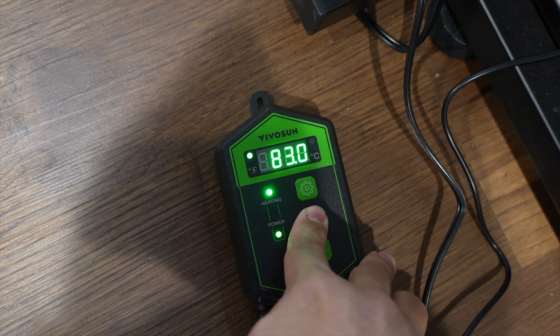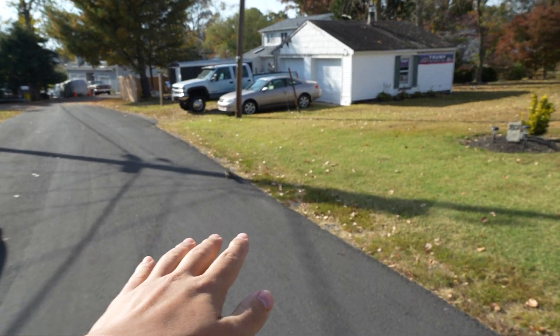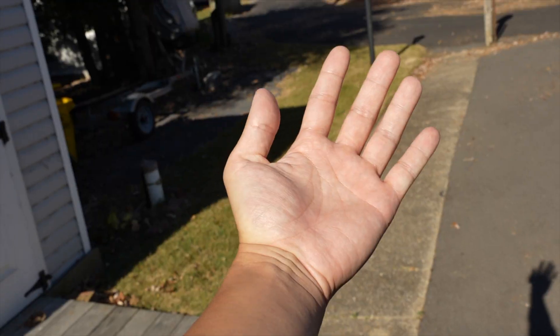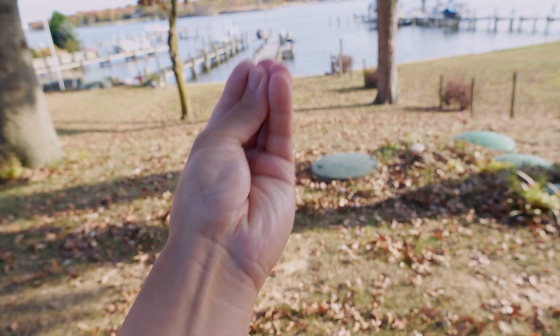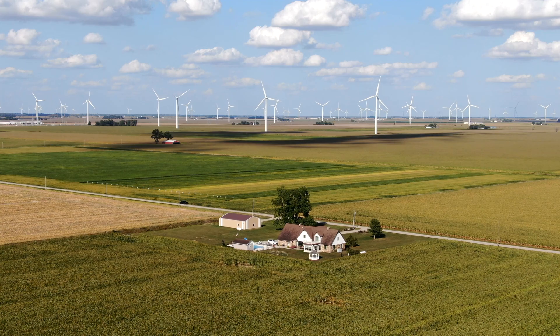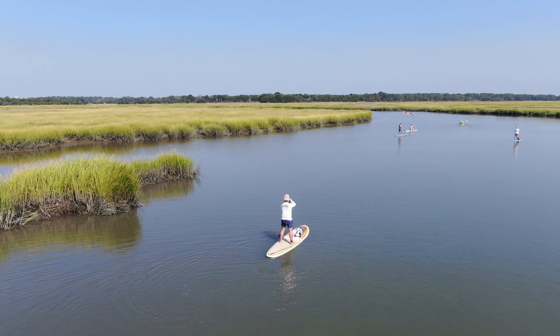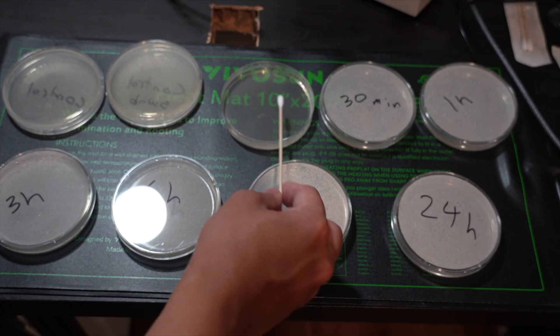Now that we've set up our materials, we can finally get this frankly disgusting test started. The first thing I did was go stand outside with my hands in the wind for 10 minutes. I did this not just because I'm insane, but because I was curious about how much crap is in the wind blowing around us and what my hand might pick up. Air and wind is an incredible medium for carrying around stuff in general — it pollinates our plants, carries salt from the ocean, and blows around countless microorganisms from soil, fungi, plants, and animals.